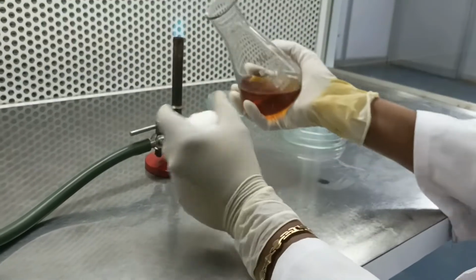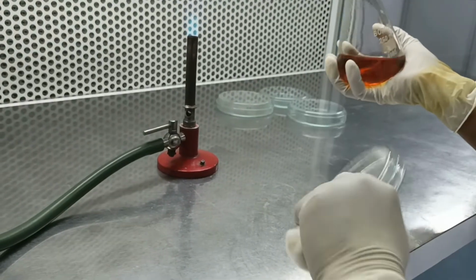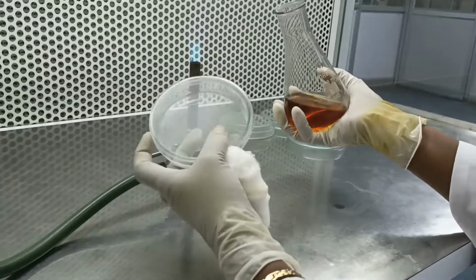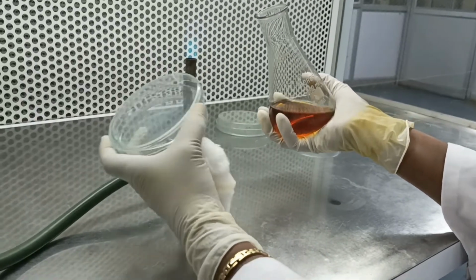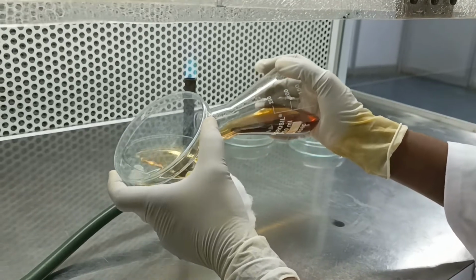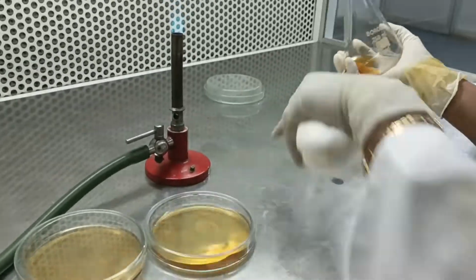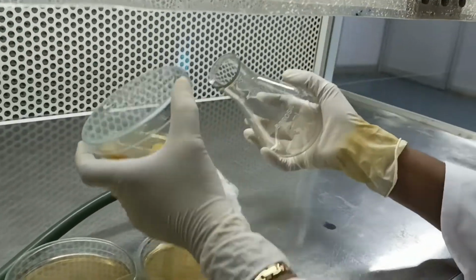Next, go for pouring. Pour 16 to 20 ml of melted cooled nutrient medium in the petri plates. After pouring, allow the medium to solidify. After solidification, keep the plates in an inverted position.